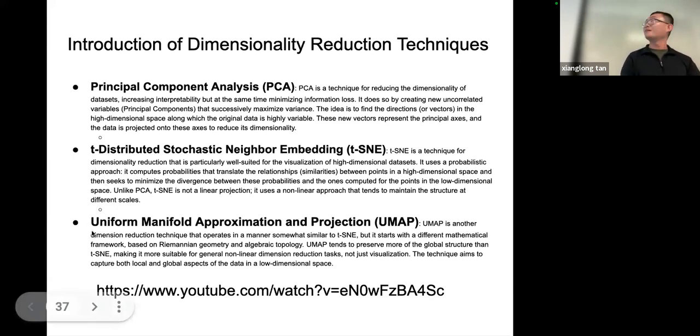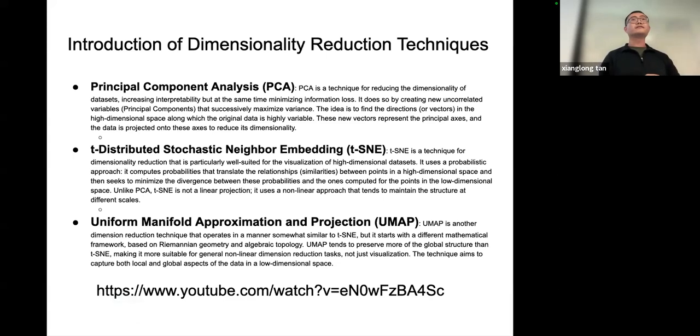Maybe they were first published around 2015 or 2016. Those two algorithms are constantly used in single cell data analysis for identifying different clusters of single cells. So what we are going to do is use this single cell data analysis method on our bulk RNA-seq data sets.